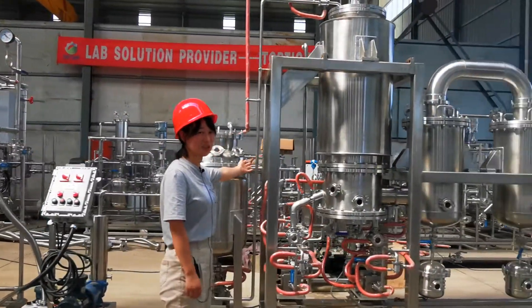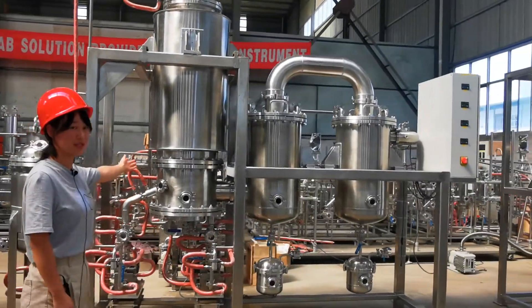And for this equipment, it's our molecular distillation equipment. It's for the separation steps.